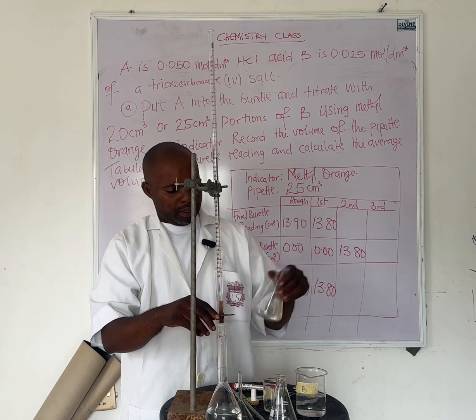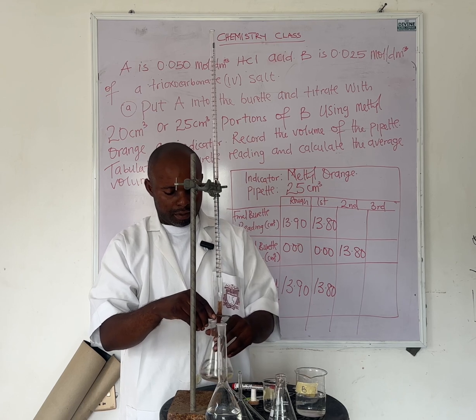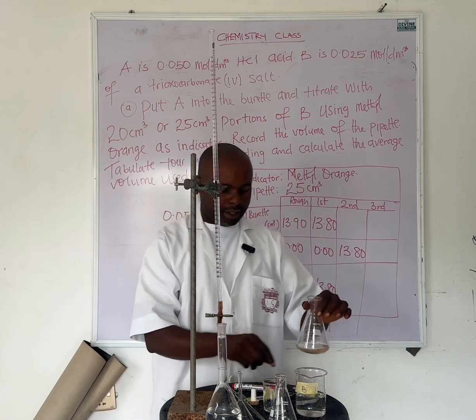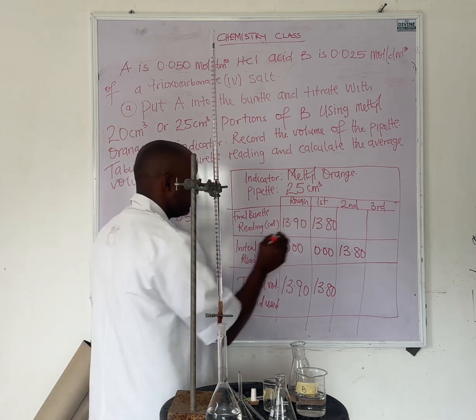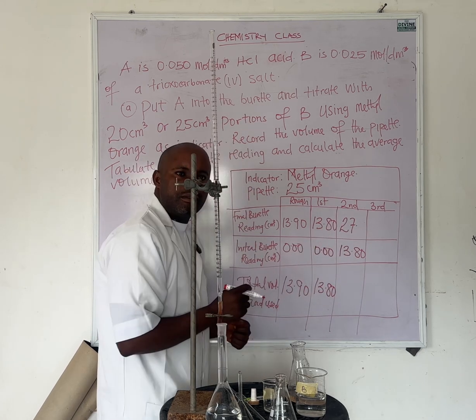All right. We shake. See color change. Color change. All right. We're having 27.6.